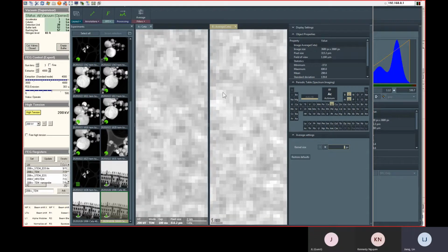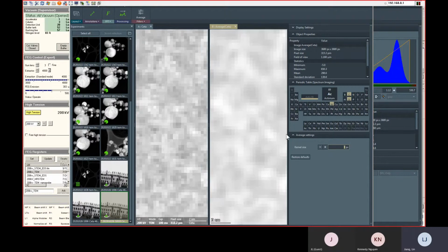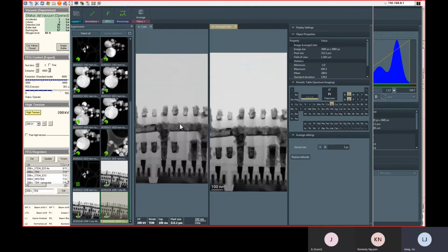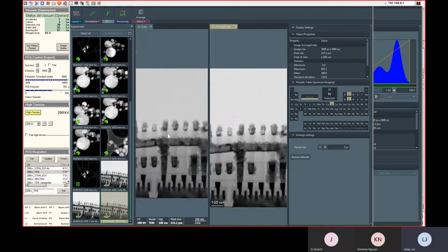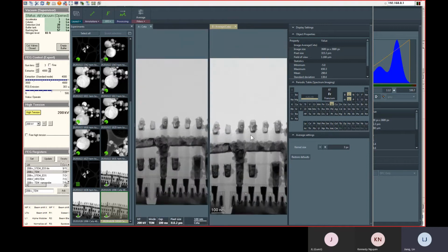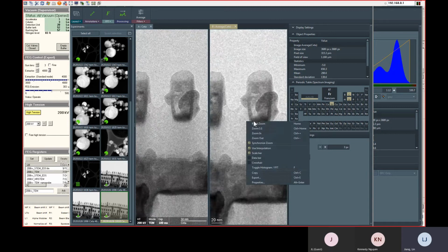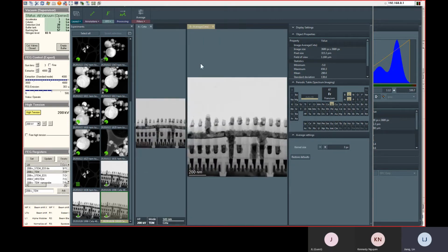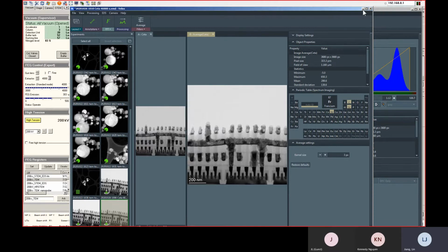It's like the original image, right? You do 3 pixel, 1, 2, 3, 1, 2, 3, 1, 2, 3. This 3x3 region has a similar contrast. Then if you zoom out, you can see the right side imaging looks more uniform. It's not gonna give you more contrast, but it's gonna average your contrast.